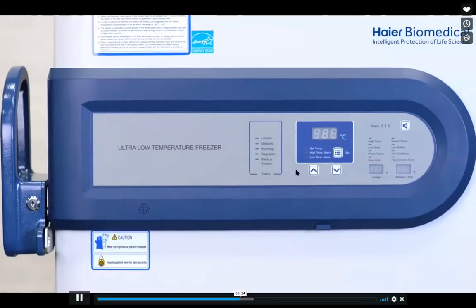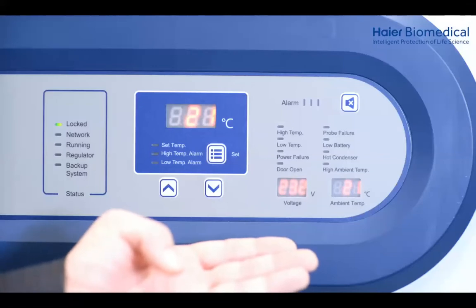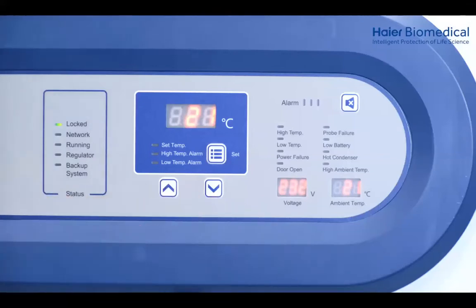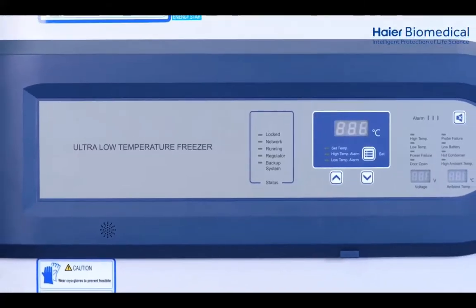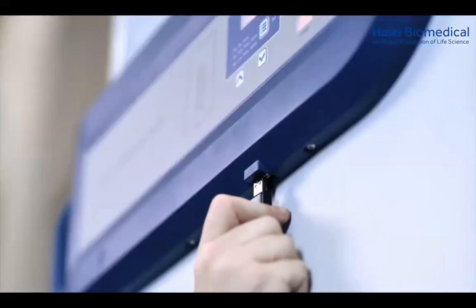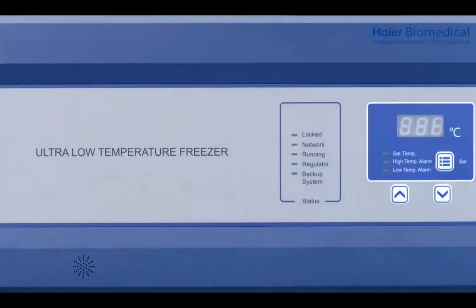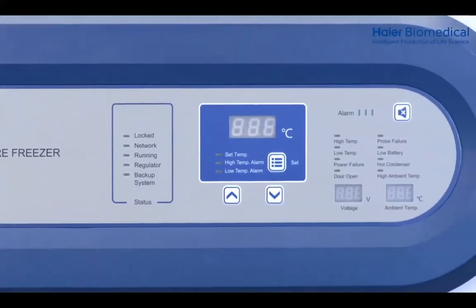This is the LED controller for the J series. It has a readout for the internal temperature, the ambient temperature, and the incoming voltage provided by the supply. This information is stored every 6 minutes for 10 years and can be accessed via a USB port on the bottom of the controller. This will give a .csv file for traceability and maintenance.